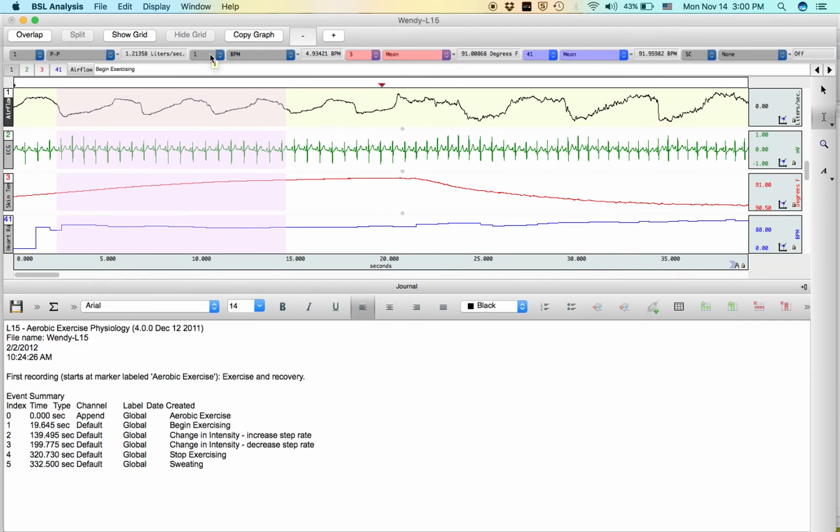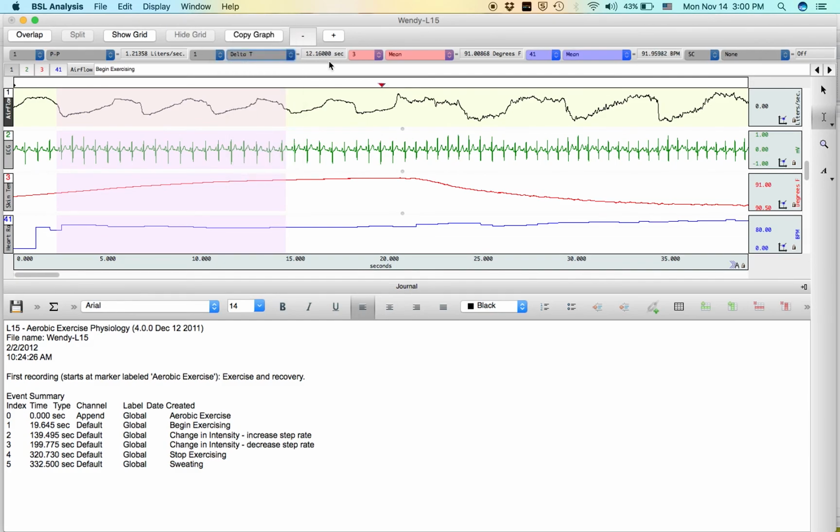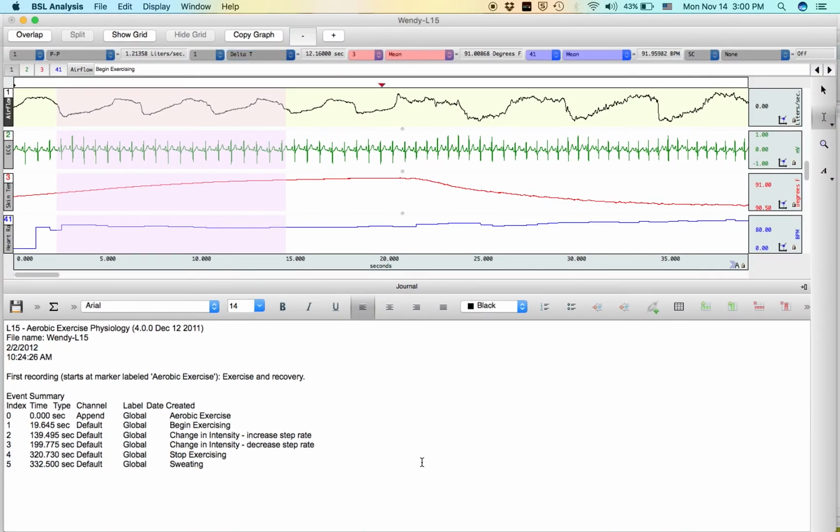And now I want to see channel 1 delta T. How long does that take? And it takes 12.16 seconds. So I'm just going to go ahead and write that down here. 12.16 seconds for 1, 2, 3 breaths.